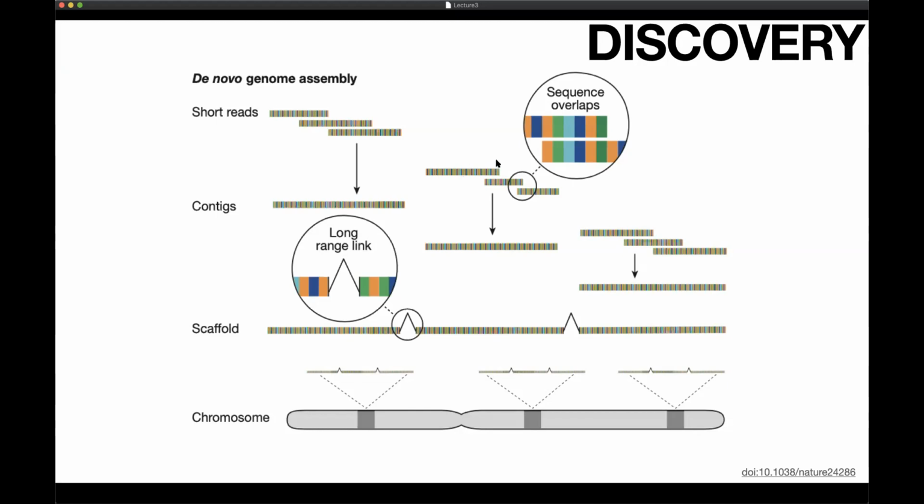And the fundamental intuition here, I'm not going to get into it too much, is that you stitch things together based on the extent of sequence overlap. So if you sequence deeply enough, you can basically walk your way across the DNA molecule by patching pieces together that should be together, right? Again, that's hard to do in practical applications for a variety of reasons. Some of them are errors, some of them are the fact that your reads are short, but there are standard solutions for dealing with this. Then you will assemble them into pieces that are as long as possible. They're called contigs.